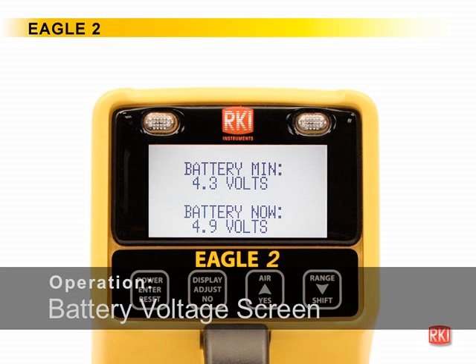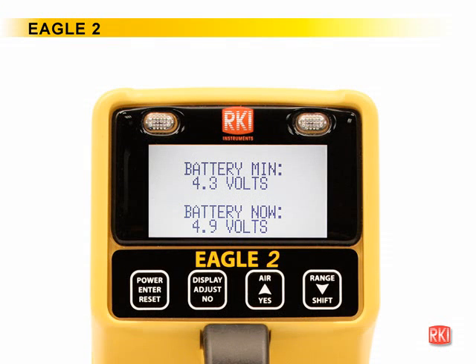The battery voltage screen displays the minimum operating voltage and the current battery voltage. Fully charged alkaline batteries typically indicate 6 volts. Fully charged nickel metal hydride batteries typically indicate 5.2 volts. This screen also displays during the startup sequence.